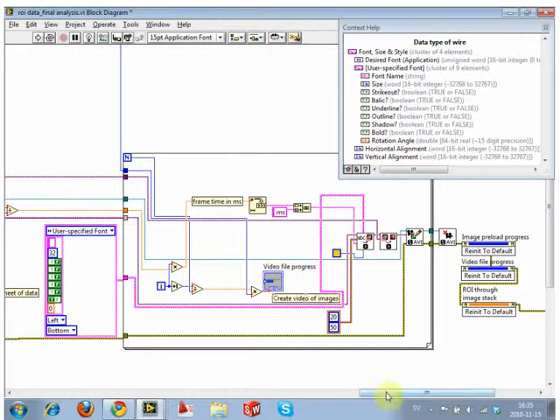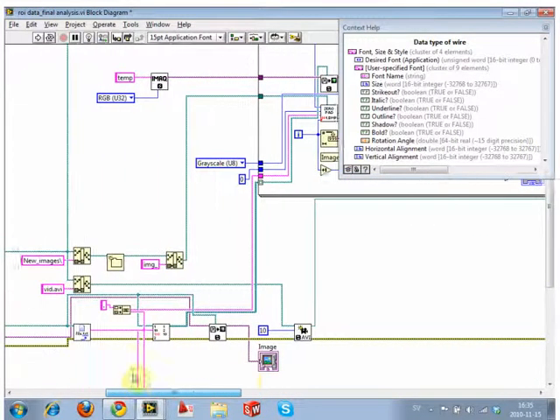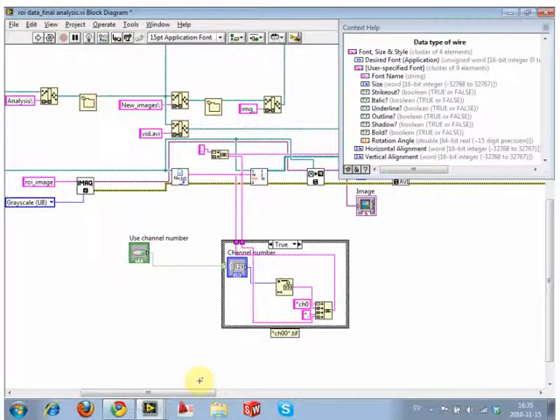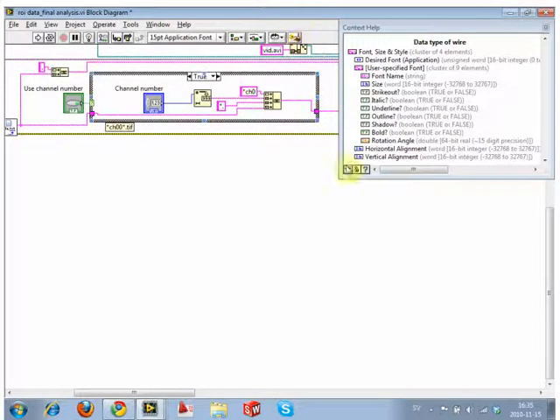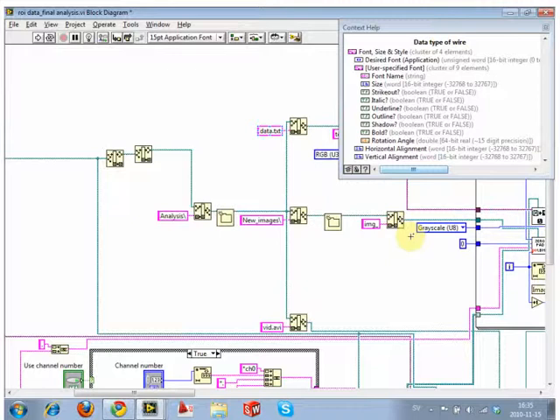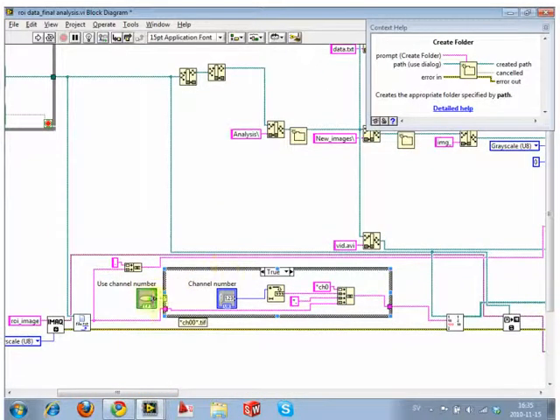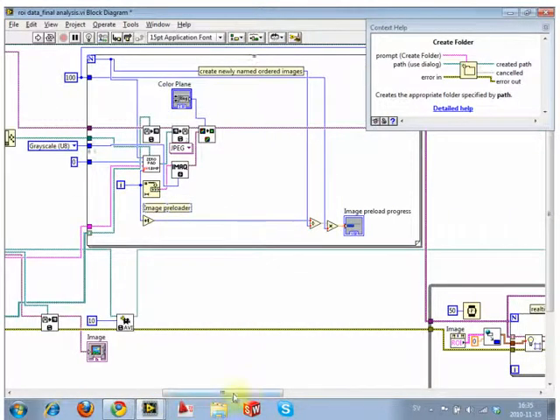But yeah, so, I mean, there's a lot of hierarchical stuff in this VI that should give you some hints on how to arrange things. I try to leave it as flat as possible, meaning it looks messy as all hell. Even if you hit clean up, I'm sure it can't clean much up, because it's still going to be messy. I mean, we're making a file structure, where to put things. And we can't even sub VI this because it's so dependent on what you're doing. There's nothing to sub VI. But if you so wished, you could put things like this in a sub VI and clean things up. Same thing with this. We could clean up sections of it, but keeping it this way allows you to follow the data a little bit easier. Maybe not totally easy, but easier.